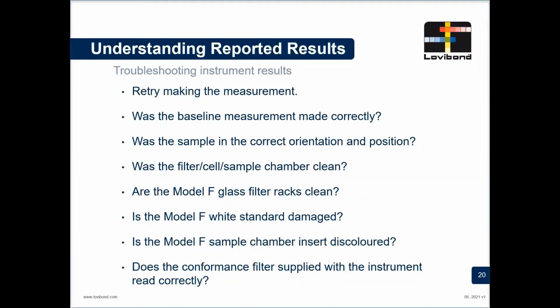Is it towards the front in a model F? Is it towards the back in a model FX? Is it to the right hand side in a PFXI? Do I have a cleanliness issue with my instrument? Was everything clean? Were the sample cell windows clean? Was the sample chamber itself clean?